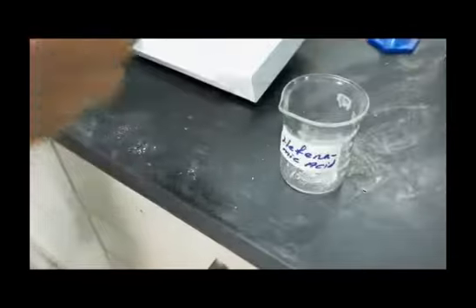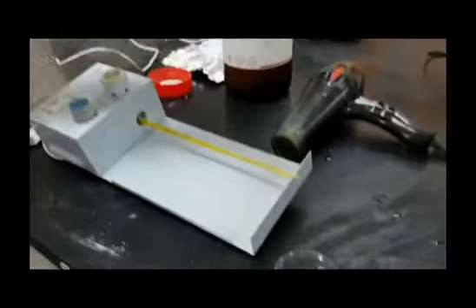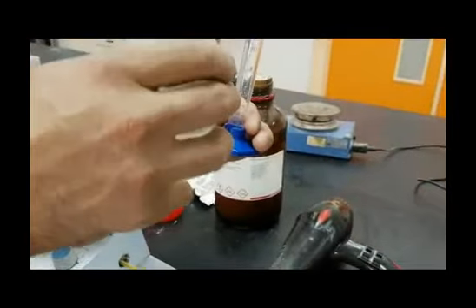Measure 3 ml of distilled water using a measuring cylinder and add it to the measured quantity of mefenamic acid in the beaker.